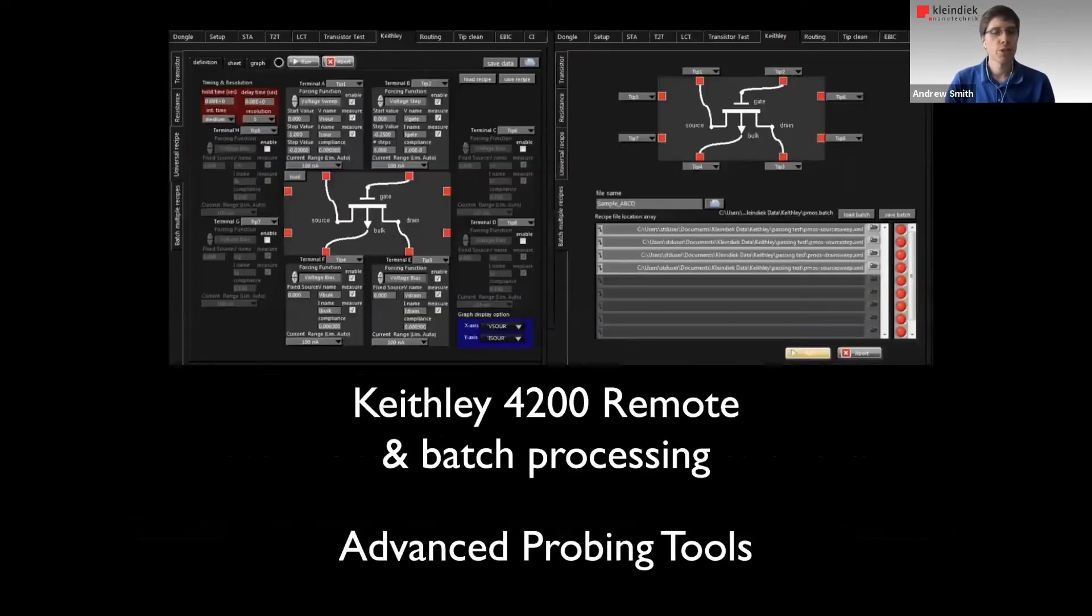And the next step is then to switch to a parameter analyzer of some sort. The Keithley 4200 is not our product, but it's something that is very common in the failure analysis world. And so we decided to incorporate it into our software interface so that we can drive it without having to focus on another computer with another system and another interface. So you can generate measurement recipes here any way you like, customize them and save them. And then you can load these recipes into batches and run them as sequences. So you place your probes and you walk away and then you come back an hour later and your measurements are done. And you're greeted with an Excel sheet with individual sheets for all the individual recipes, and these include SEM imagery, as well as plots and the raw data, of course, for further analysis. We also recently included the Keysight B1500 system. That's another option that can also be operated in the same fashion.